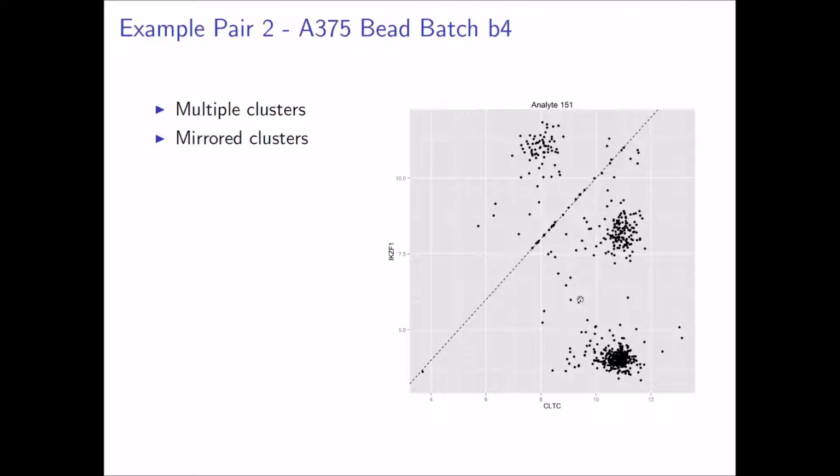It's just to show that it's not just that cell line. Here's another cell line. It's the same set of gene pairs, so beads, as the other plots. But again, you still see this multiple clustering effect, and some cases where you get a lot of points right on that x equals y line.